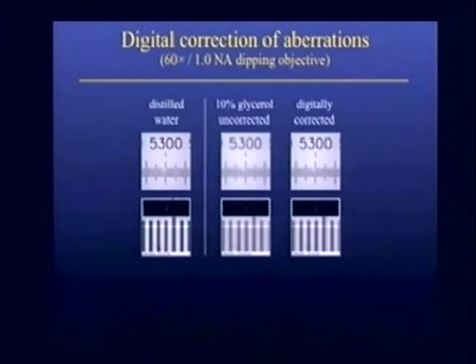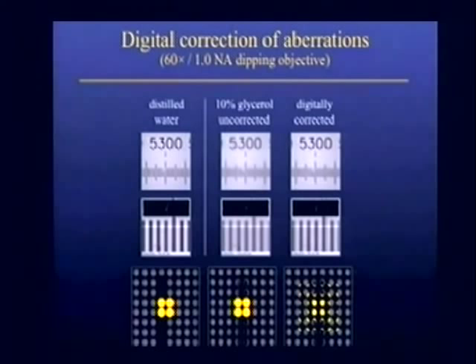And in 10% glycerol, instead of the distilled water for which the objective was optimized, we can improve the contrast. And if you look at where we're getting our rays from, indeed, in the corrected case, we're beginning to borrow rays from adjacent microlenses. This is not the same pattern that I showed you before for digital refocusing, but it has the same flavor, a bunch of central rays and then some borrowed rays.